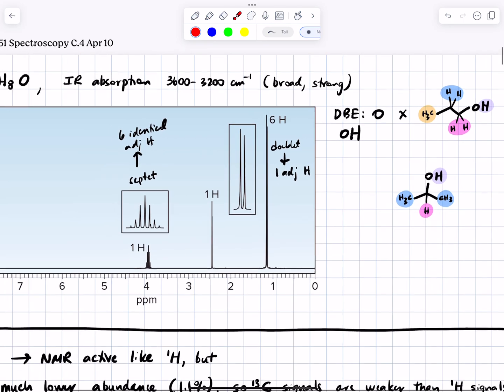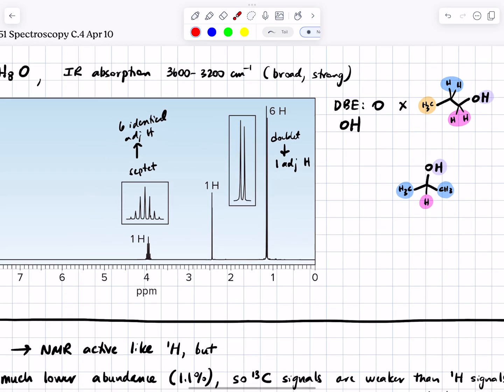Okay. So we've looked at chemical shift, we've looked at integrated peak area, we've looked at splitting, we've looked at number of signals. All of that points to the fact that this is our unknown molecule. All right. So we were able to settle in on an answer pretty quickly, but it's better, instead of just moving on and forging ahead, to make sure all of the data are consistent with your answer. Okay. Other questions?